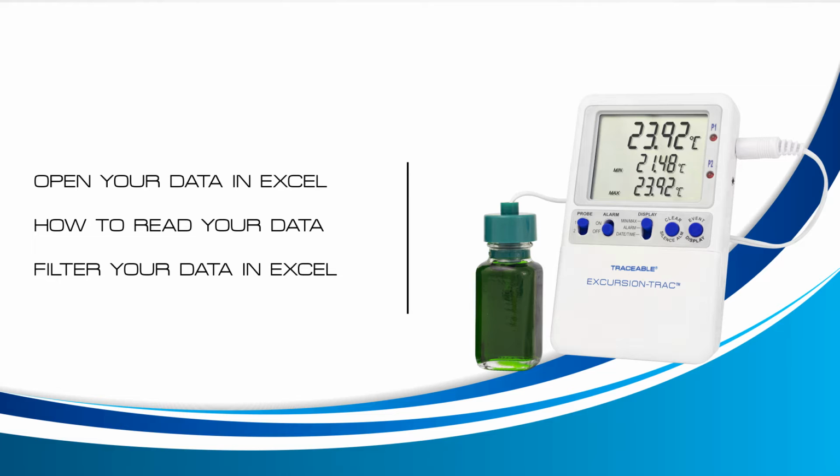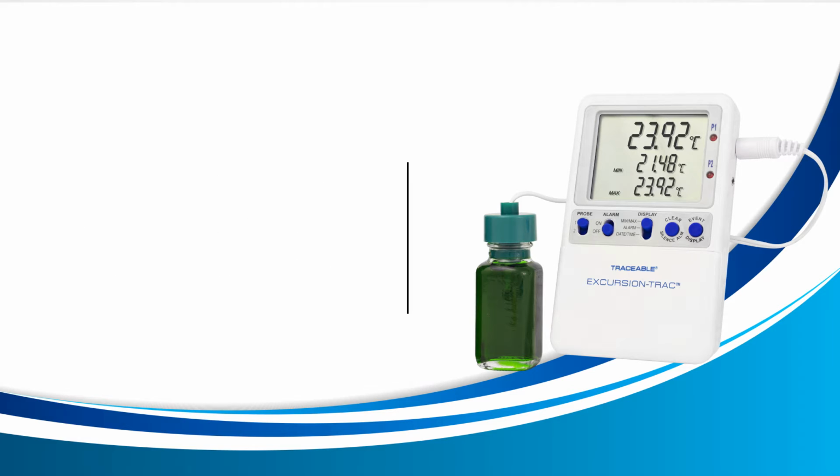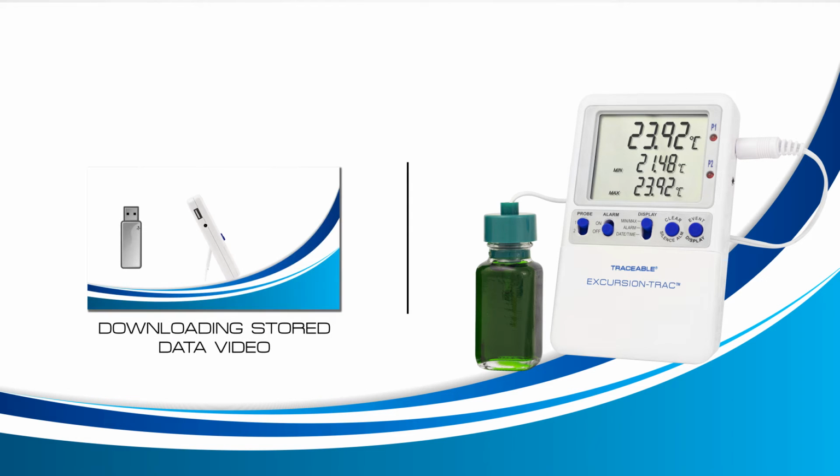Before we get started, be sure you have downloaded your data from your Traceable Excursion-Trac thermometer or Traceable Memory-Loc thermometer. If you need help with that, please refer to the Downloading Stored Data video. Click on this box and it'll take you to that video. Once you have your data ready, let's go to our computer to view the data.